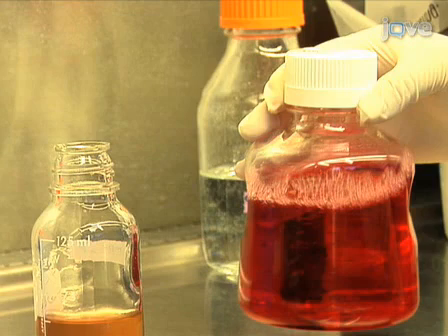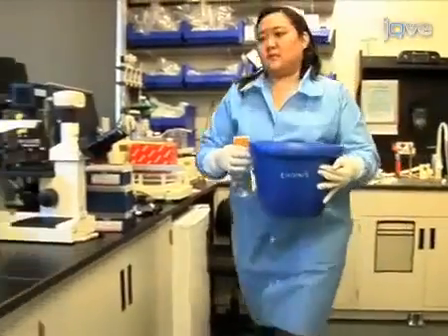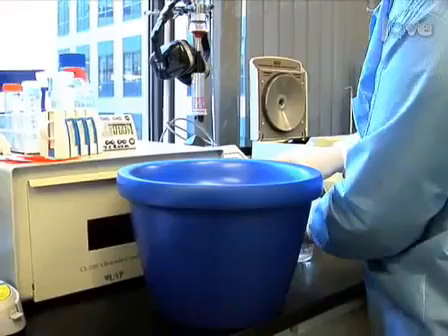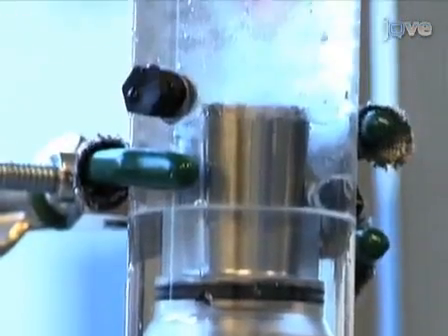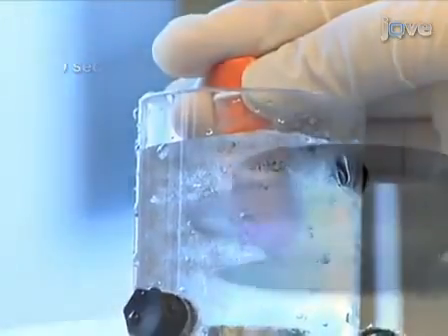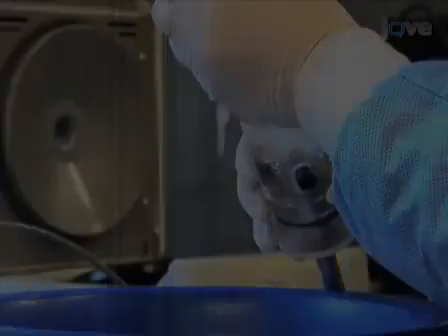If you are using sucrose purified virus, skip to the next session. If you are using a crude Vaccinia virus stock, sonicate an aliquot of the virus just before infection in a cup sonicator with a bath of mostly ice and a little water. Sonicate it around 30 W for 20 seconds. Vortex the tube and repeat the sonication 3 times, adding more ice if needed.